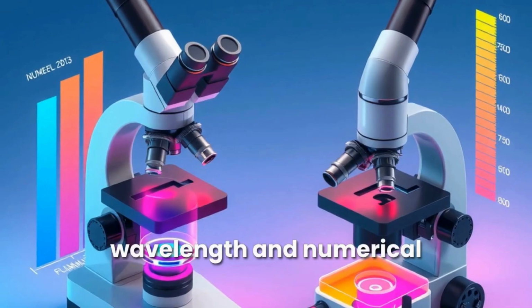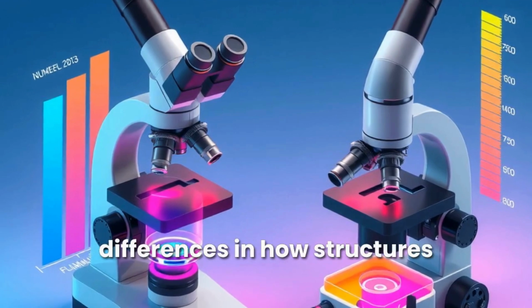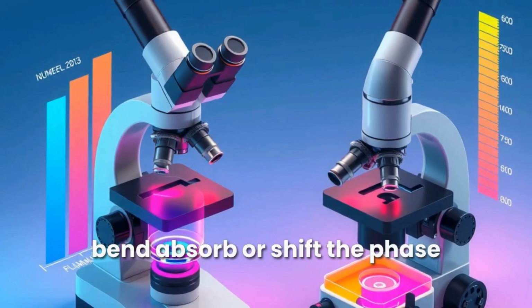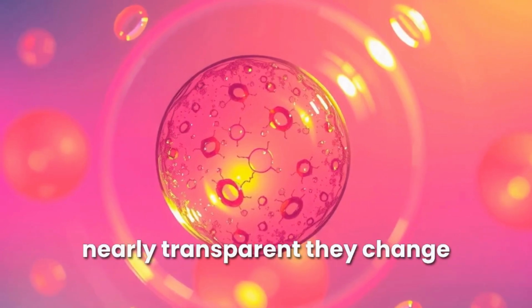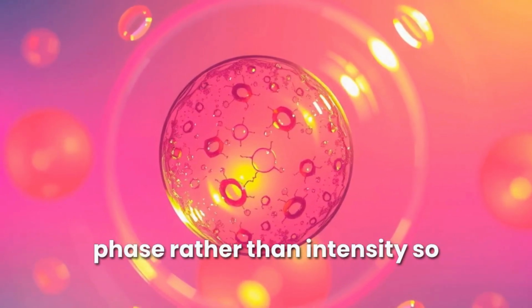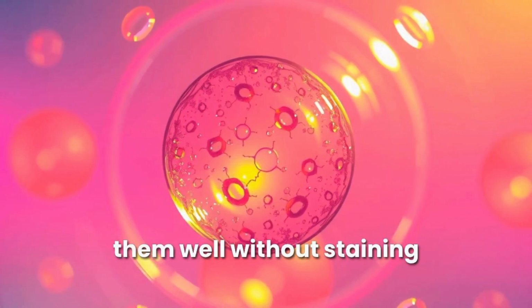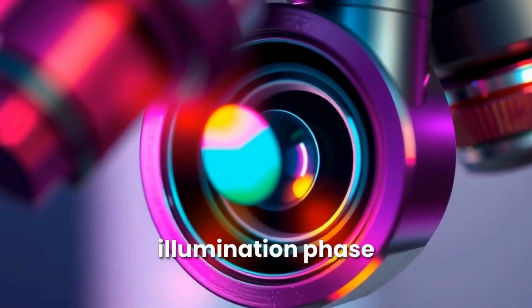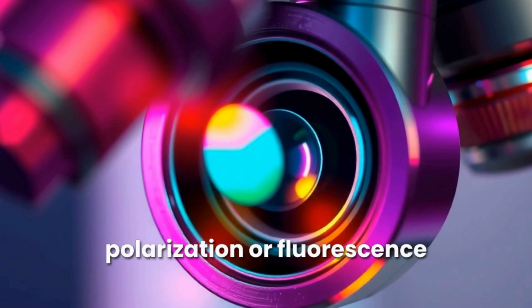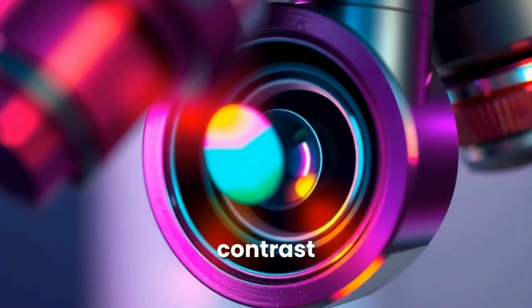Resolution depends on wavelength and numerical aperture. Contrast depends on differences in how structures bend, absorb, or shift the phase of light. Many biological samples are nearly transparent. They change phase rather than intensity, so bright field cannot reveal them well without staining. Special techniques manipulate illumination, phase, polarization, or fluorescence to convert subtle optical differences into visible image contrast.